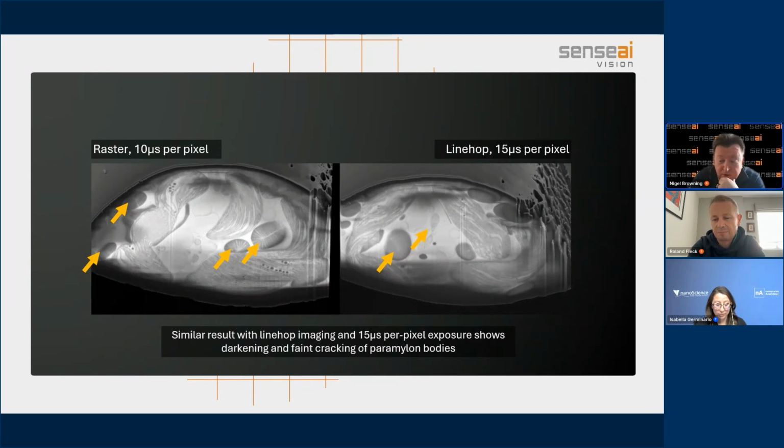But in principle, we can use a different subsampling pattern for every frame that we are acquiring, do the reconstruction from the subsampled data, and then average those together in the same way as you would average any group of images that you want to put together. So yes, you can do it. You don't have to. It's really, again, what I was saying before, a degree of freedom that we can use to help solve the problem that we're trying to address.